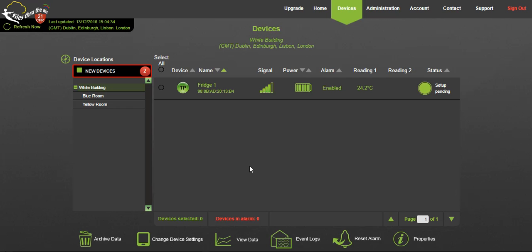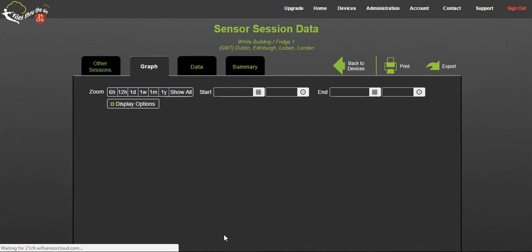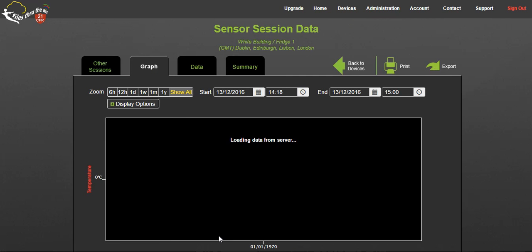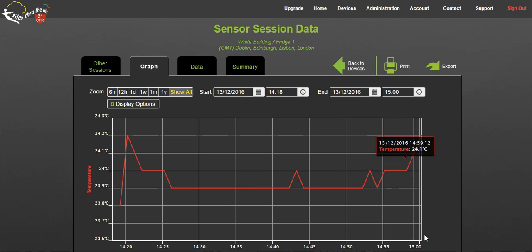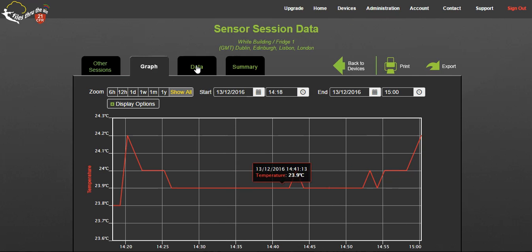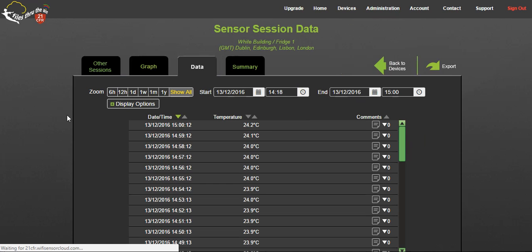To view data, select your device and click on the view data button. This will show data in graphical form for the duration of the logging session. Click the data tab to see that information in tabular form.